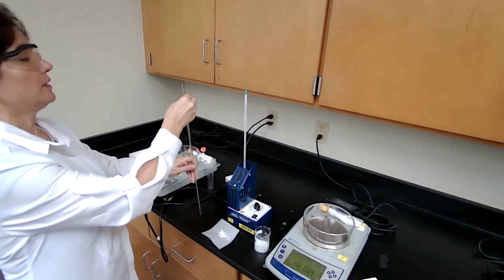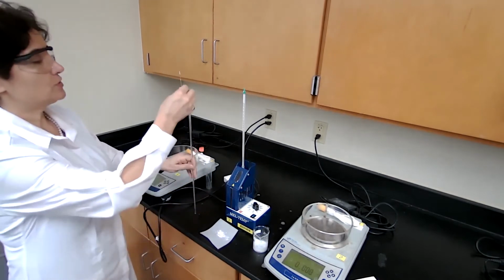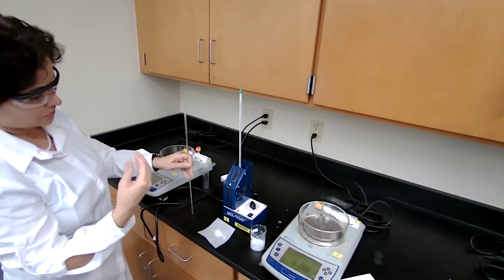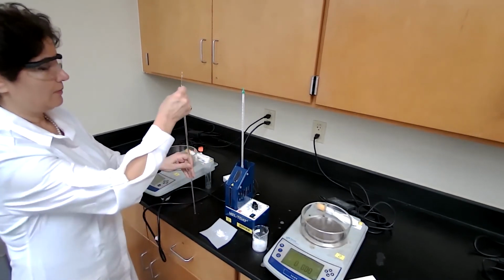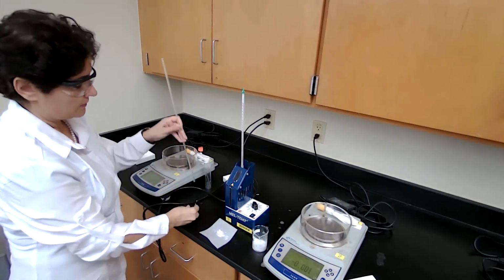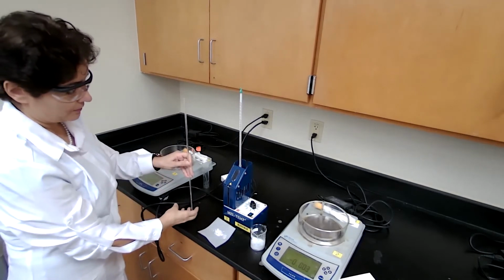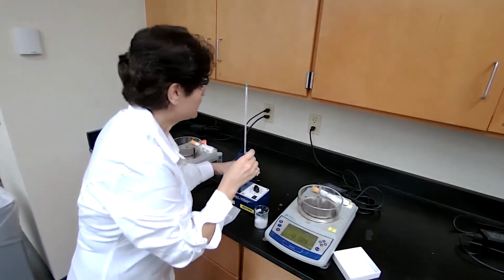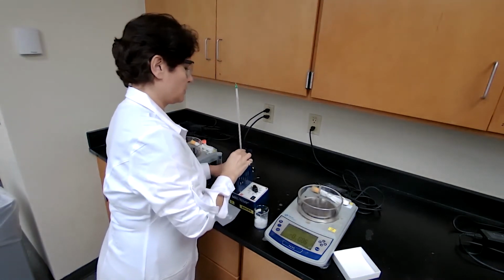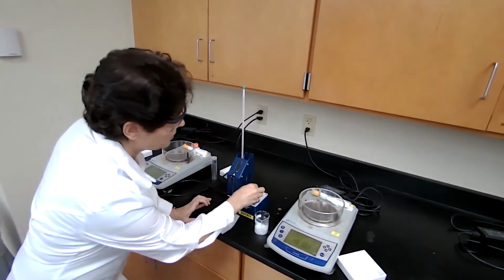You're all pros at measuring melting point now, so you know all the steps. I'm just trying to get it done and show you also as I'm measuring the melting point for this sample. Capillary tube, place it in the sample holder, and I use the same thermometer that I calibrated last time. I'm using the same thermometer.